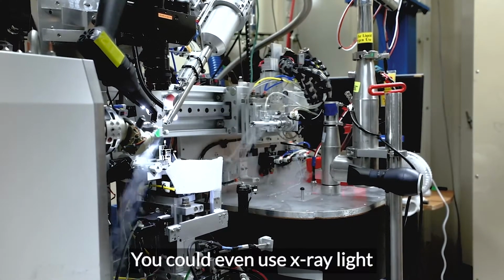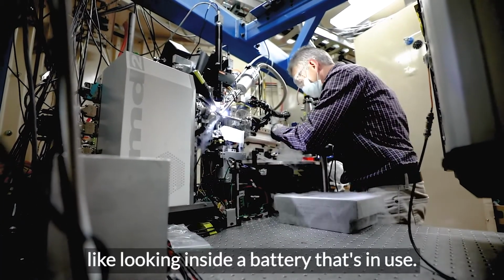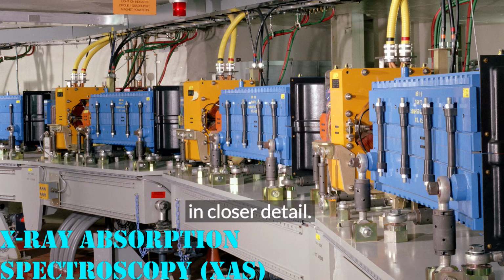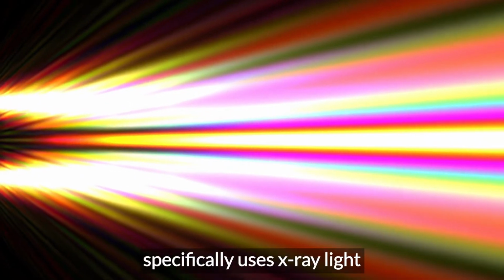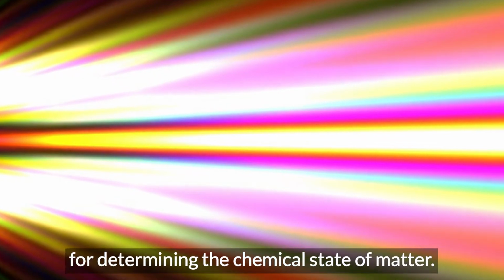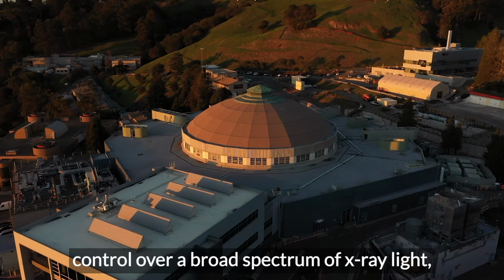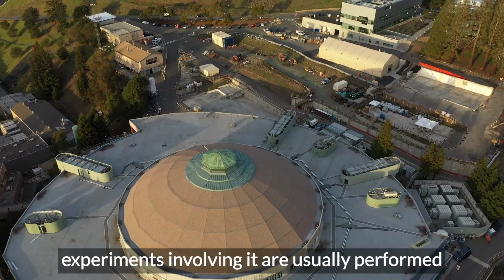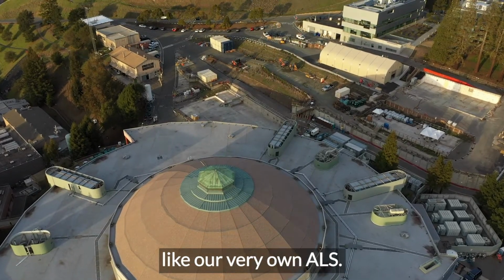You could even use X-ray light to look inside of matter performing work, like looking inside a battery that's in use. Let's take a look at the two techniques in closer detail. X-ray absorption spectroscopy specifically uses X-ray light for determining the chemical state of matter. Because this technique requires precise control over a broad spectrum of X-ray light, experiments involving it are usually performed at a synchrotron light source like our very own ALS.